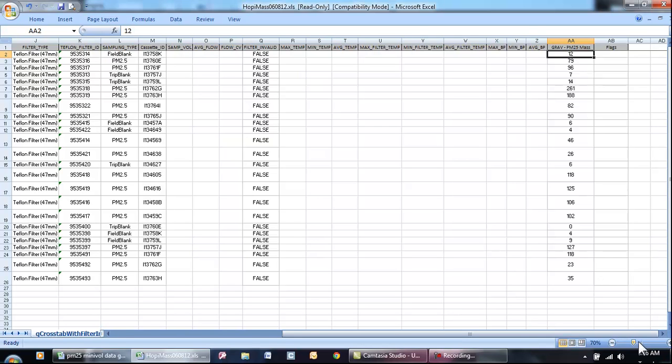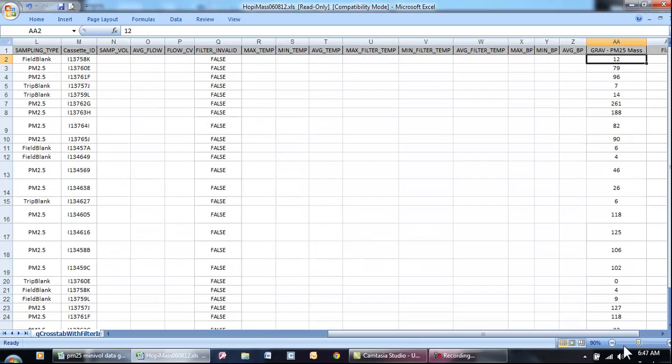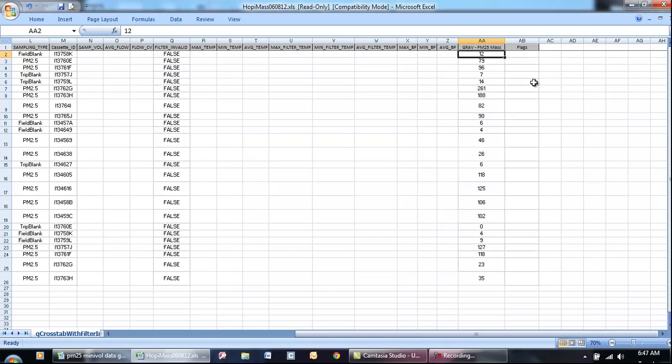So to make it easier to look at, be sure to use these zoom buttons, which can zoom in or zoom out, and then you can see the end of the data is way over here in this column, with the most important bit being way over here where you might miss it.